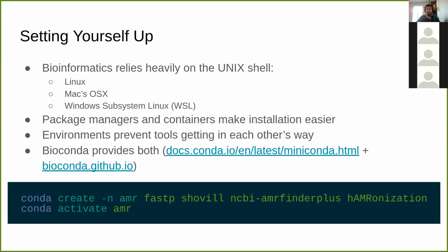You can also do it through Windows now, thanks to the introduction of Windows Subsystem for Linux 1 or 2. This lets you run a little Unix shell that will let you do a lot of these bioinformatics things. There are probably some rough edges with Windows Subsystem for Linux 2, but there are lots of different ways you can get access to a Unix shell.